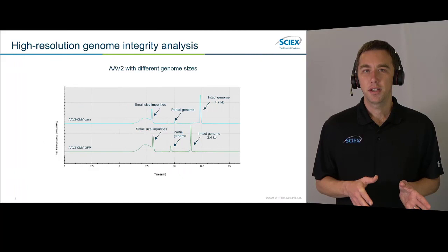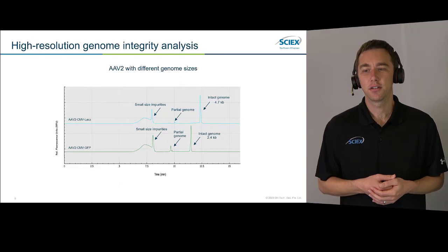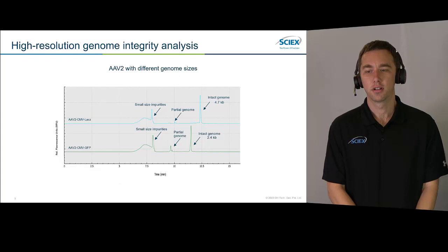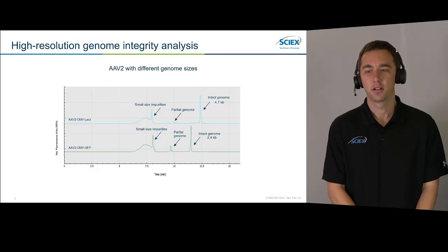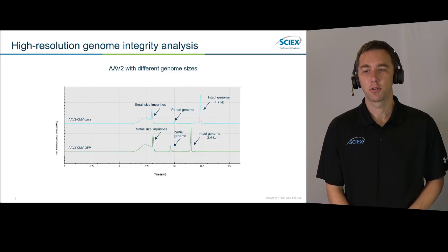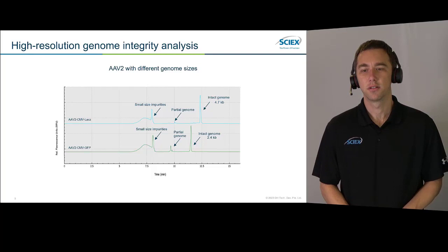This assay gives you a much better sieving range and resolution on size determination than other methodologies out there. Here we're looking at two different genome sizes for an AAV serotype 2 capsid — a 2.4 thousand base genome length and a 4.7 thousand base genome length — and you can see we have quite a bit of resolution there, well over a minute. In both cases we have quite a bit of potentially partial genome and other impurities. On CGE, you can really get high sensitivity and high resolution, compared to what might just appear as smears on a gel.